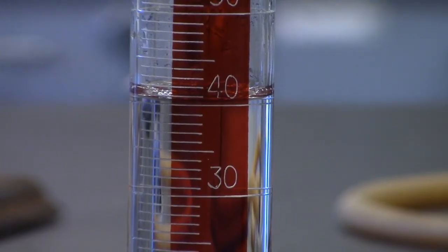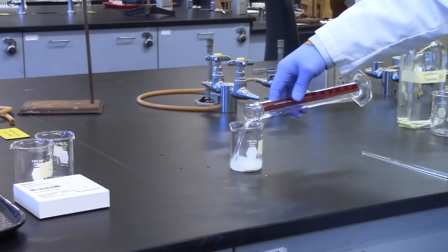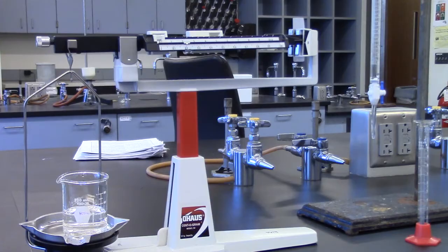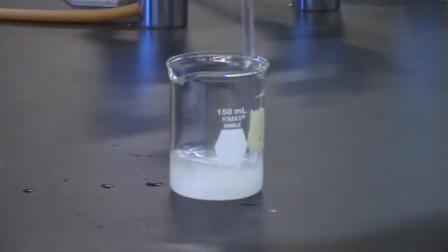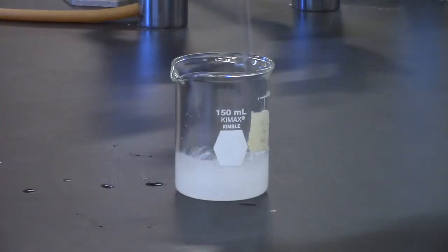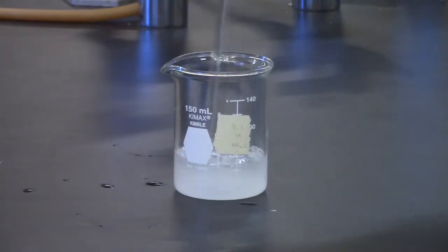While one partner is weighing out the sucrose, the other should be measuring out 40 mLs of distilled water using a 100 mL graduated cylinder. Add the 40 mLs of water to the sucrose in the 100 mL beaker and weigh. Always weigh the solutions before stirring — you will lose some solution on the stirring rod. Stir the solution with a glass stirring rod until all sucrose has dissolved.